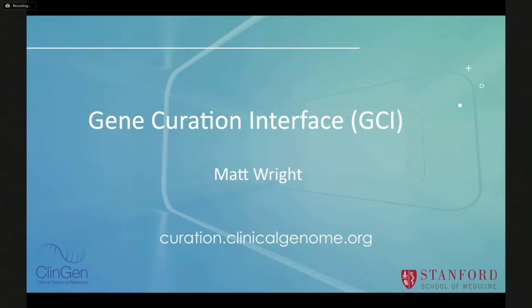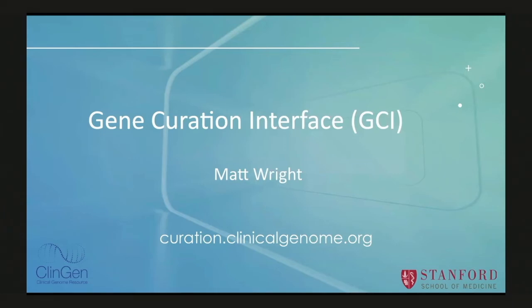So hello, everyone. It's with great pleasure that I follow on from Christine's excellent presentation that you just saw on the VCI with the pivot to the other curation tool developed here at Stanford University, the Gene Curation Interface, or GCI for short. My objective today is to walk you through the gene curation workflow that takes place within the GCI. I have to tell you, when this is normally presented, it's over the course of an hour in a training, so this is a very abridged version.